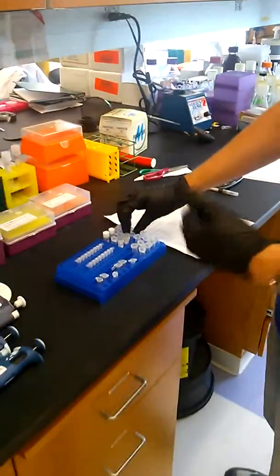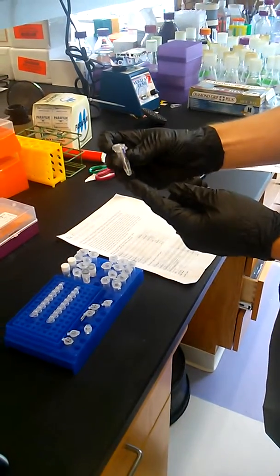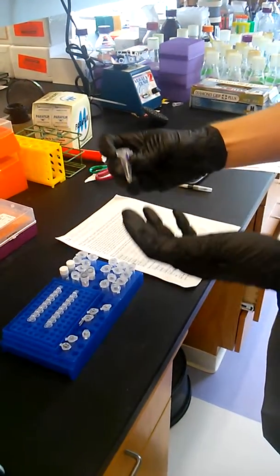So a lot of times if you're cloning or doing something like that, you use genomic DNA as your template. And that's usually purified.